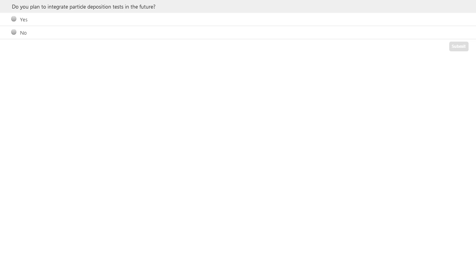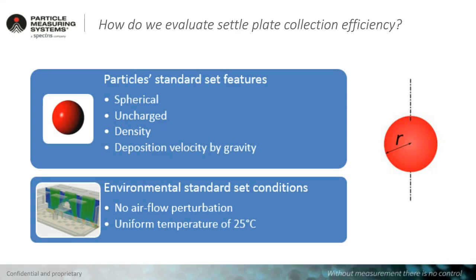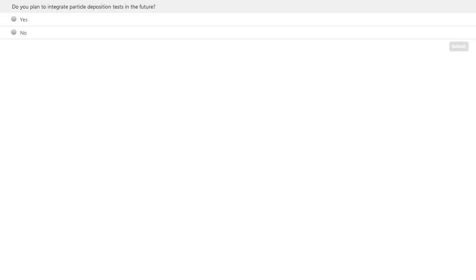Thanks a lot, Felisa, for these questions that are quite relevant. In order to understand how studies are done on particle deposition tests, we need to understand what the requirements and methodologies are. Of course, the particles used in these tests are usually standardized. Although in nature and in our cleanrooms we will never find such standard particles, for experimental design purposes we must make certain assumptions.